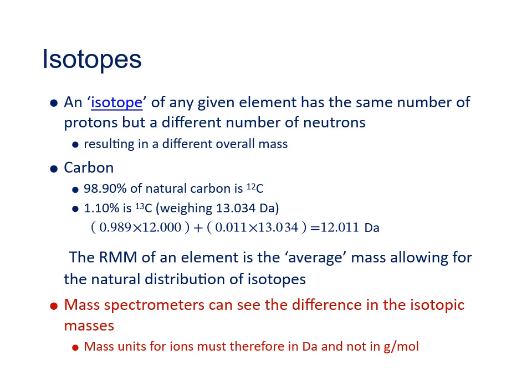But mass spectrometers can detect the mass differences of the different isotopes. So it's very important in mass spectrometry to use masses measured in daltons, not in grams per mole, and to calculate the mass of a molecule using only the lowest mass naturally occurring isotopes for each element, not the average mass. The mass of the molecule calculated this way is known as the monoisotopic mass.